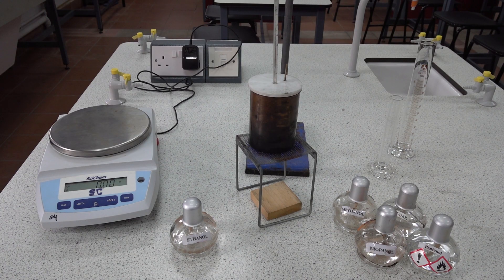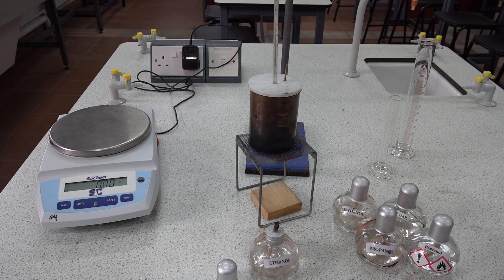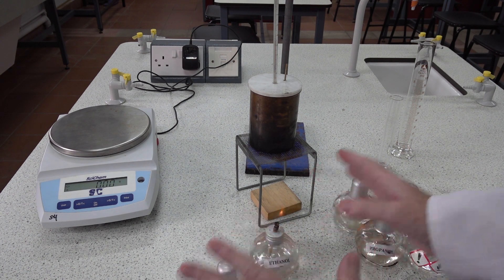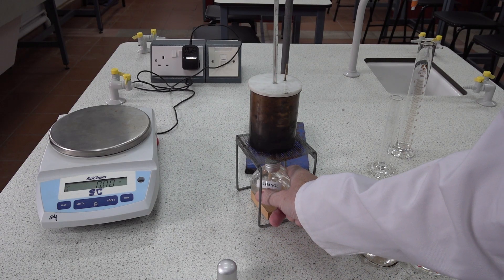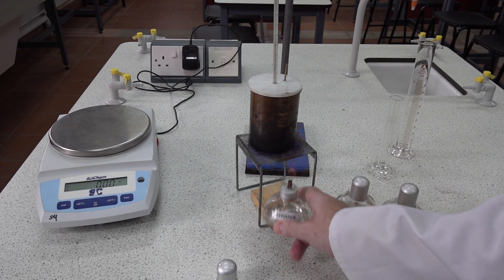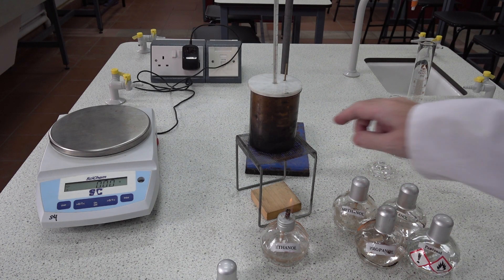We now need to consider the errors involved in carrying out this experiment. Perhaps the biggest error is transfer of heat from the flame to the surroundings as well as the water — the flame radiates heat in all directions. When we place it underneath the calorimeter, some heat is absorbed by the calorimeter itself, and we also lose heat to the surroundings and other parts of the apparatus such as the gauze.